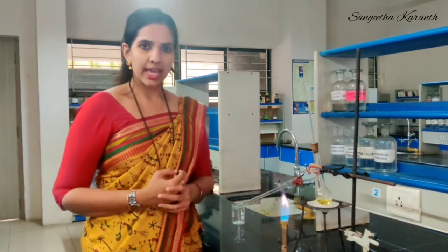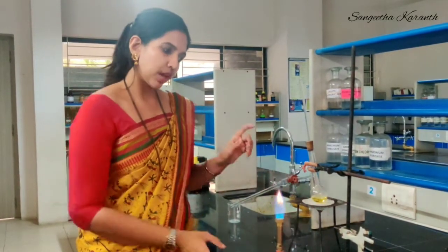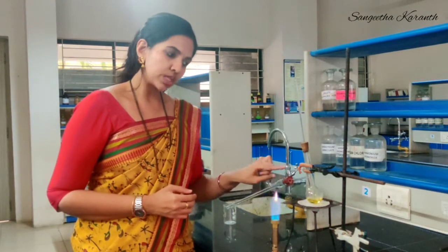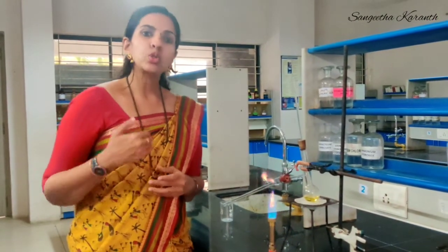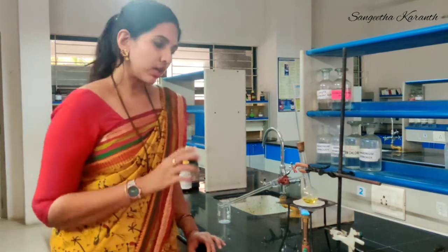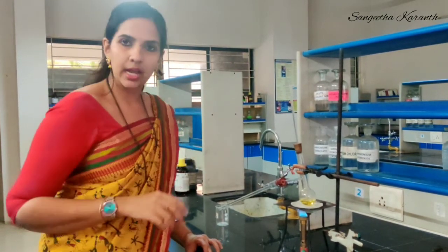Now coming on to the experimental part. We have taken the organic liquid in this RB flask. You can see this yellow colored liquid filled in the RB flask. Next we are supposed to heat this liquid. For heating, I am placing this Bunsen burner so that the liquid kept in the RB flask is heated. To avoid bumping of the liquid, we have to add boiling chips in the RB flask.